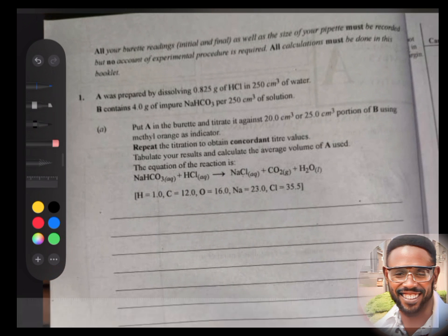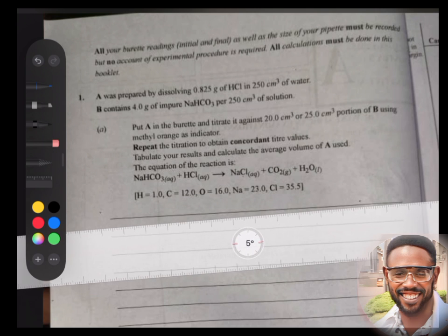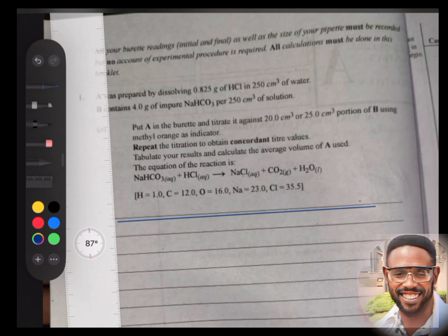First of all, we need to make our table, which I taught us how to make in my live stream. The image is not straight, so my table will not match the conformity of the picture I took. Remember not to cancel your table. You're advised to make a table of 3, 4 rows and 5 columns.